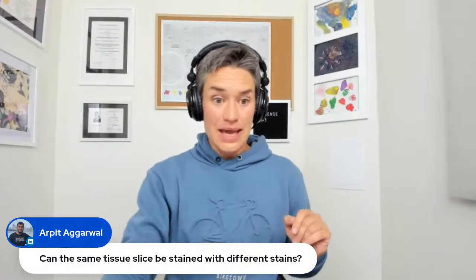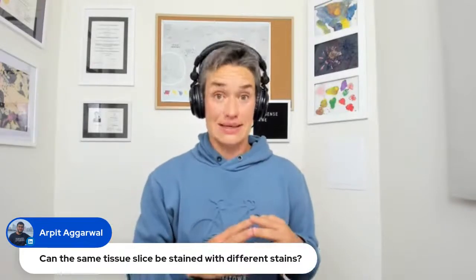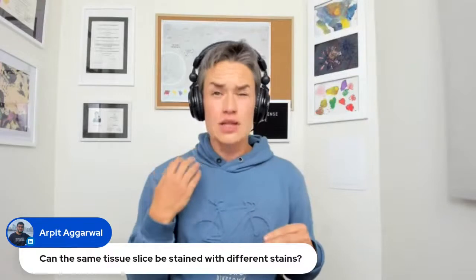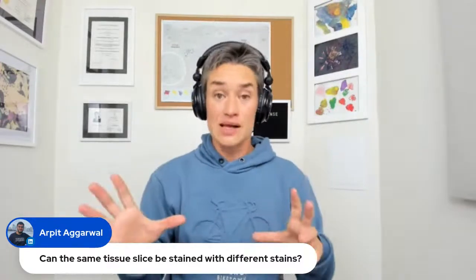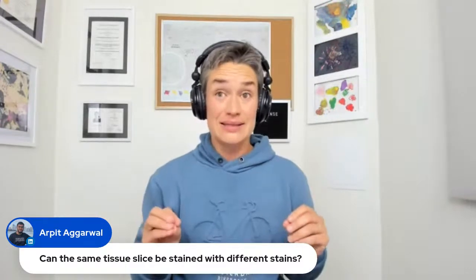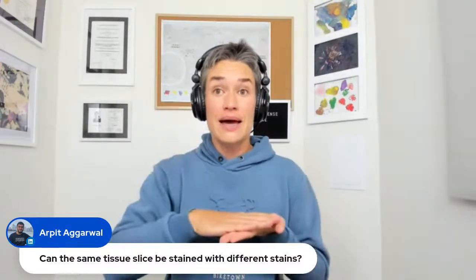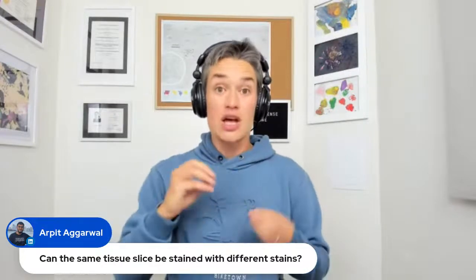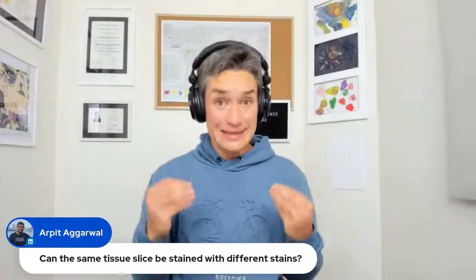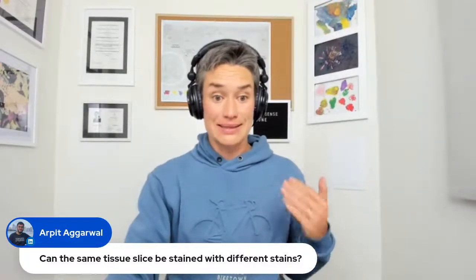And I have a question here. Can the same tissue slice be stained with different stains? Yes, it can be. You can destain. This is not the usual workflow that's happening at scale, but in a research setting, this is something very desirable, especially if you want to correlate the different things that you see from different stains. You want them to be visible on the exact same piece of tissue. So yes, the tissue can be stained with different stains.